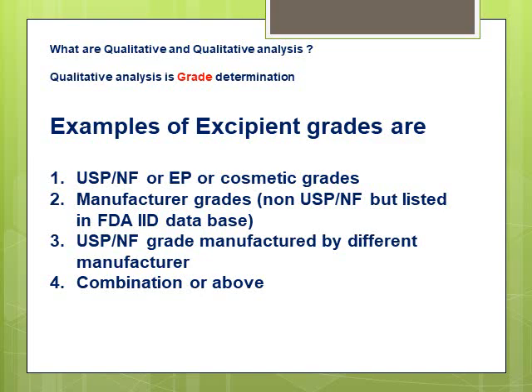You will not always succeed in doing this task, but most of the time you will figure out a grade that you could get from your supplier, which is similar to what was used in the product you're trying to reverse engineer. Not too often will you get lucky and get the grade and the manufacturer of the raw material exactly right, unless the raw material is something very trivial, let's say glycerin, where it really doesn't matter who manufactures it.